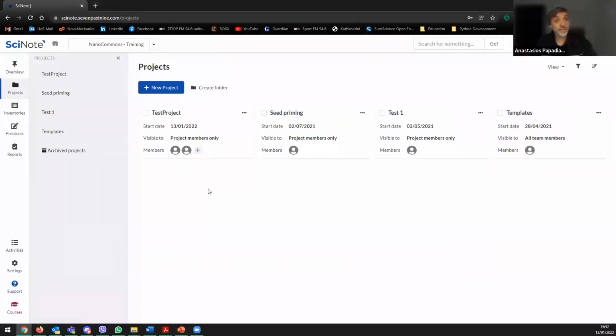And as I said, same as with the teams, in this case you have an unlimited number of projects that you can have. You can invite an unlimited number of people, and you can assign an unlimited number of people in different projects and within each project.